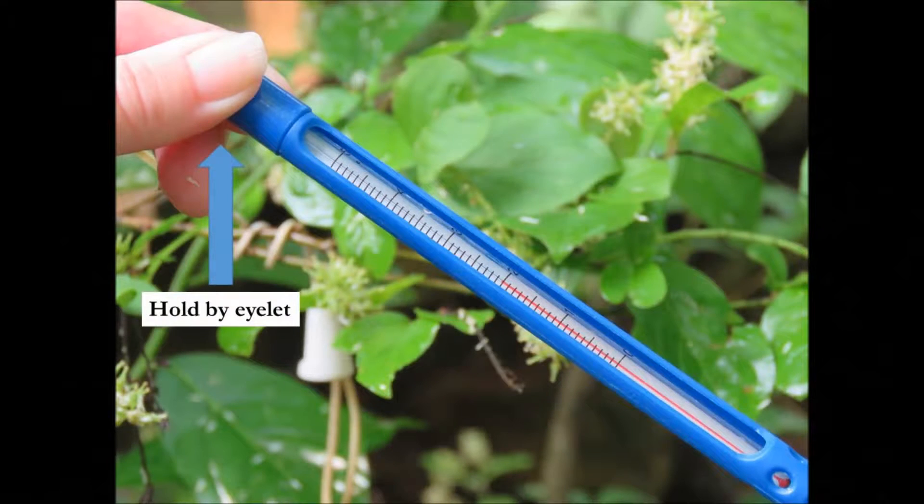Once the temperature stabilizes, hold the thermometer by the islet to avoid touching the bulb. Read and record the temperature to the nearest half degree Celsius on your data form.